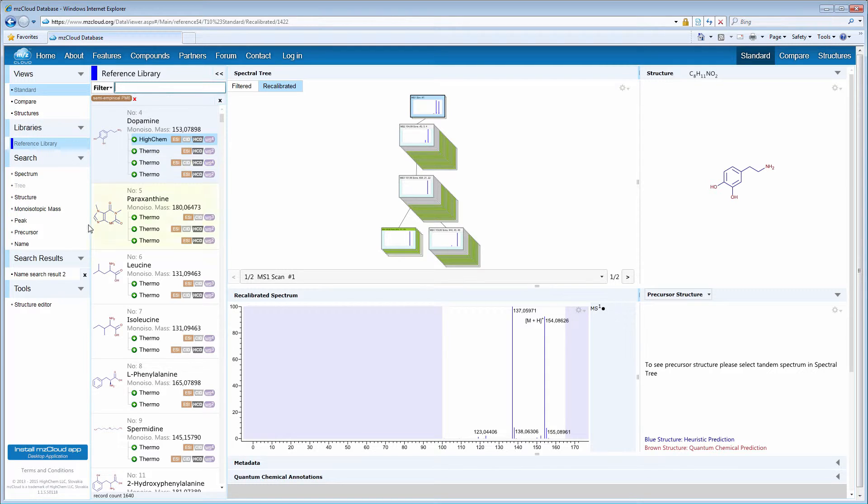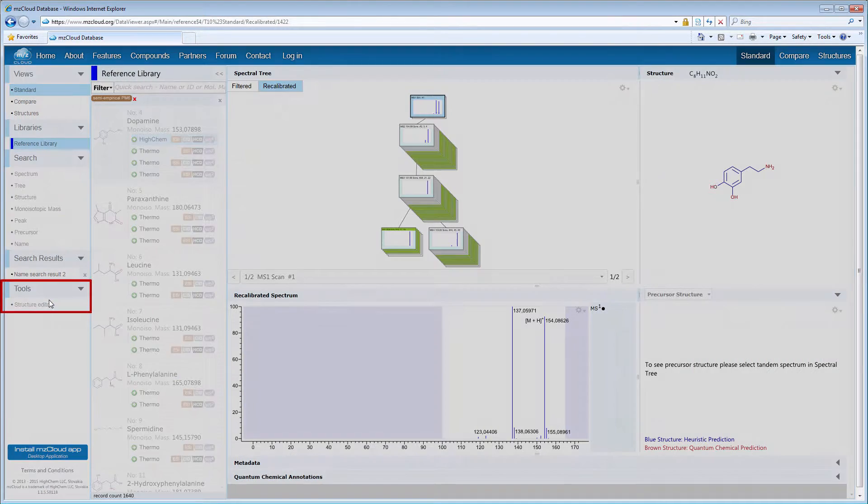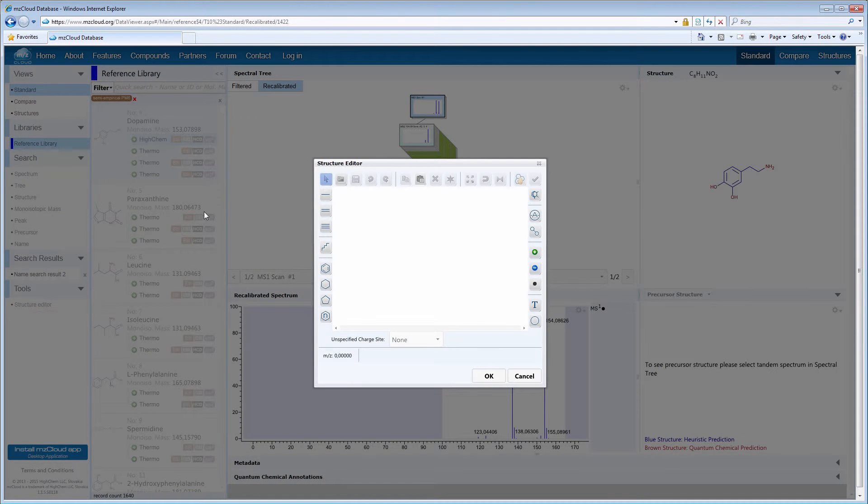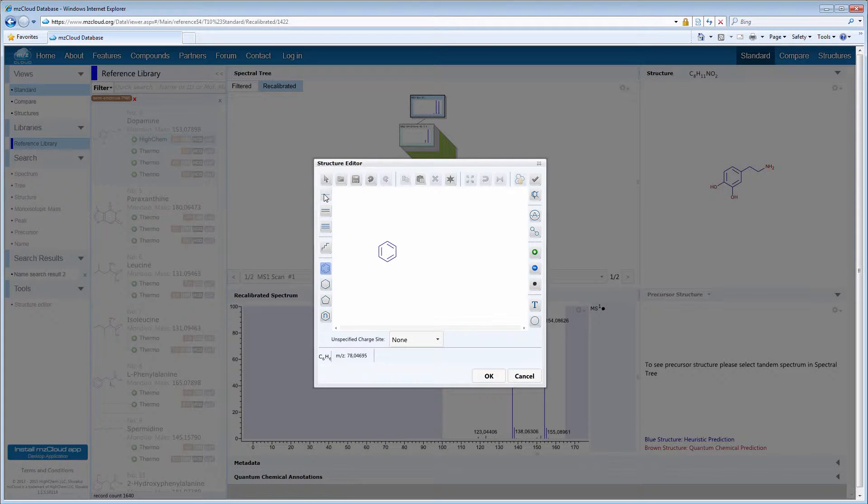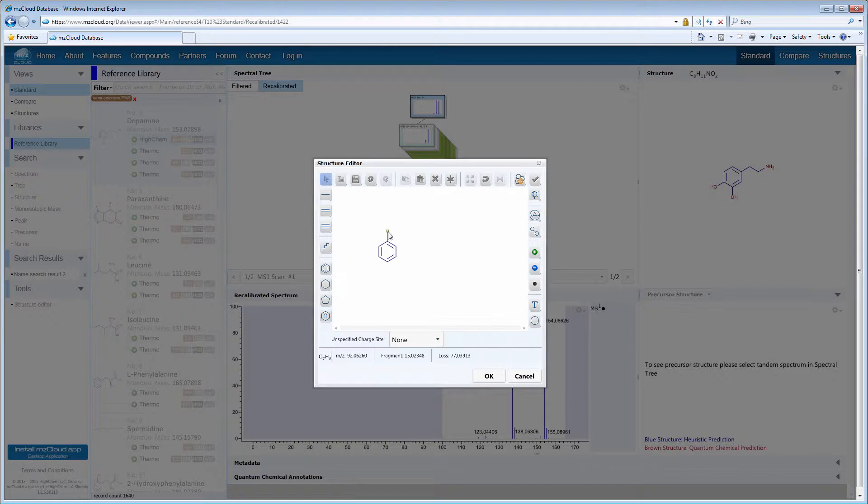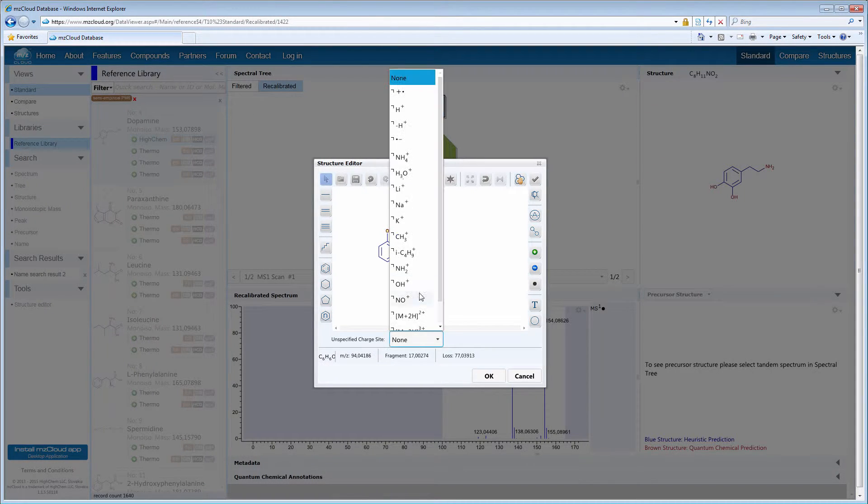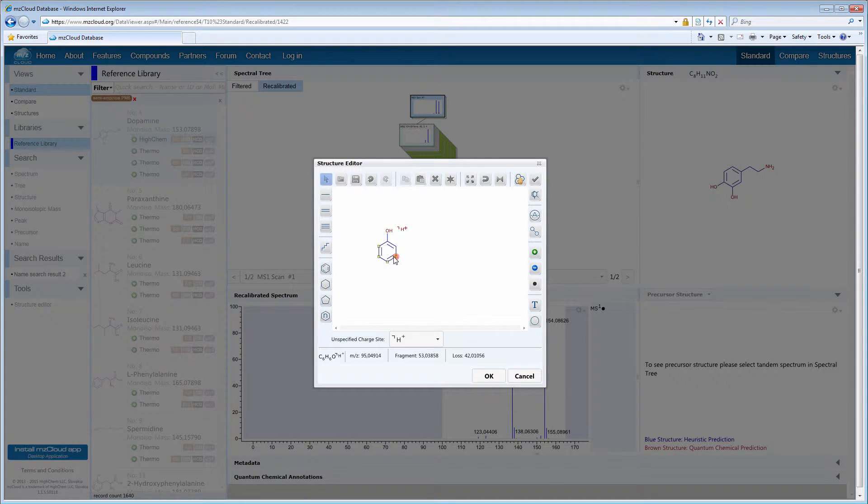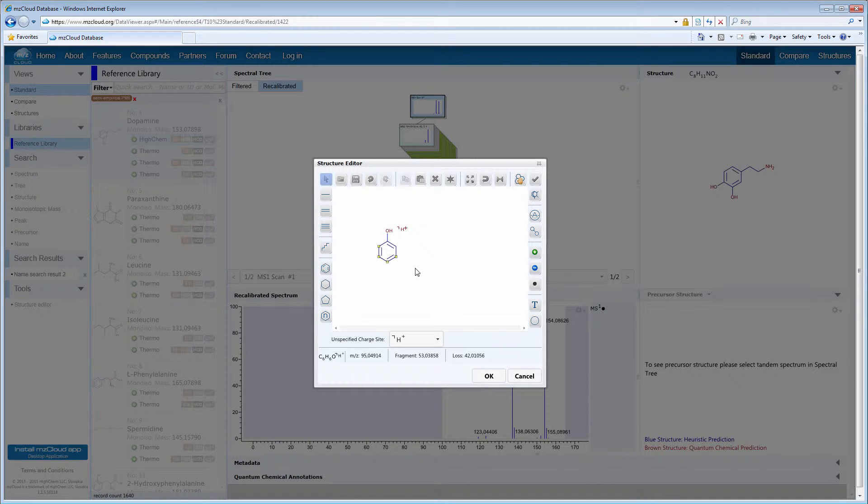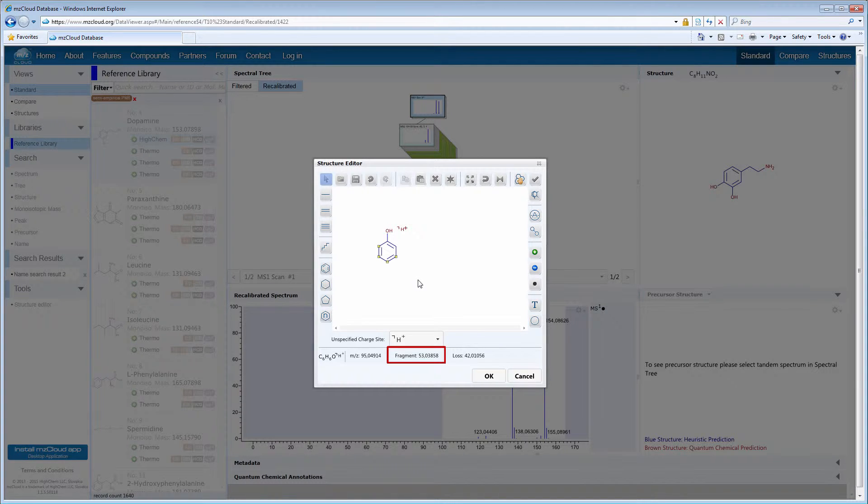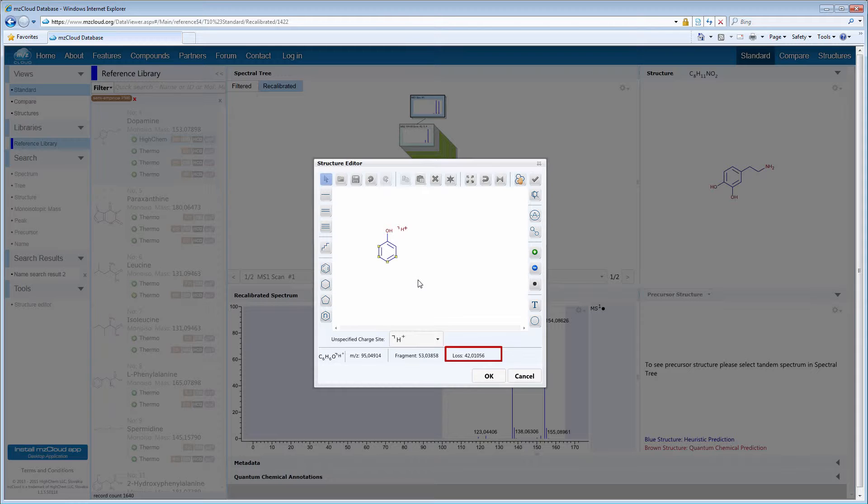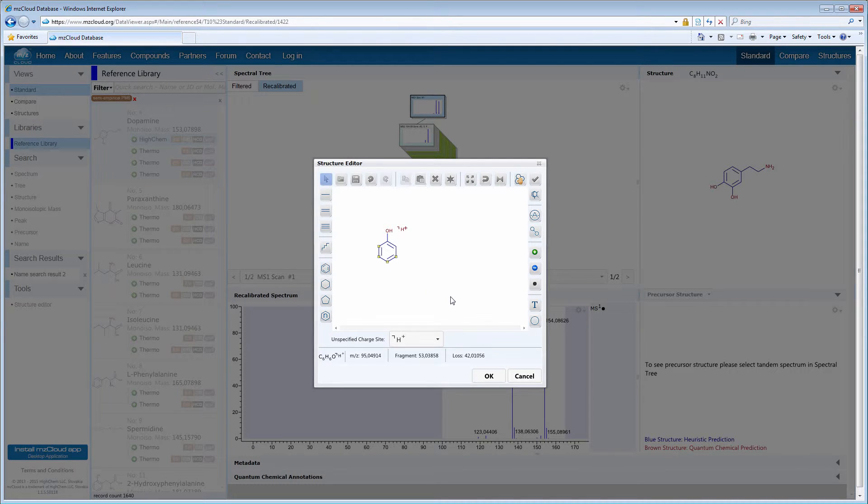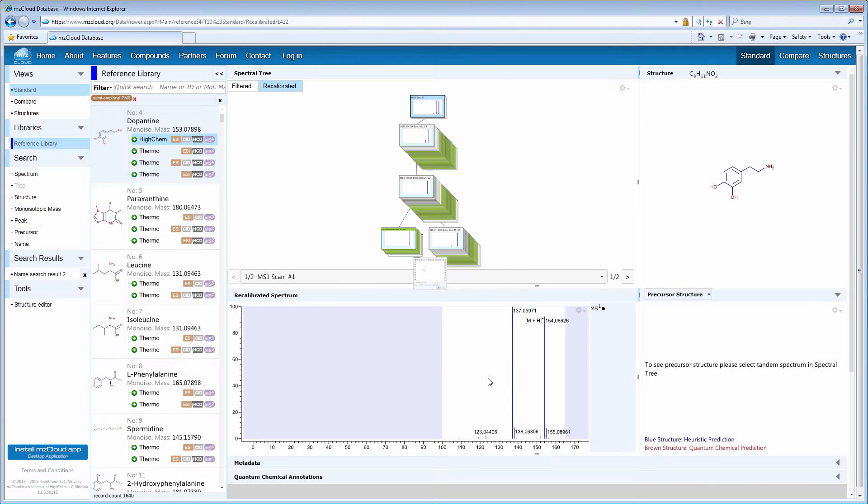Another feature is Structure Editor in the Tools menu. Here you can open, create, and edit the structure of a compound, and add a charge or adduct to it. Selecting a part of the molecule allows you to perform some basic mass spectrometry calculations, like fragment mass and neutral loss. The Structure Editor is an easy and useful tool that you will get familiar with quickly.